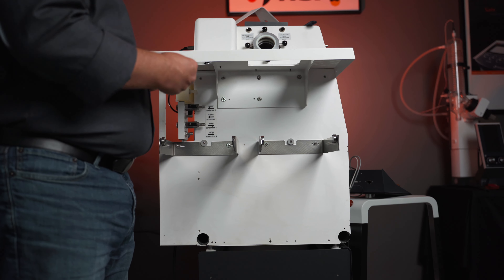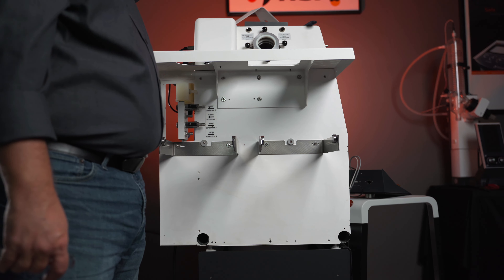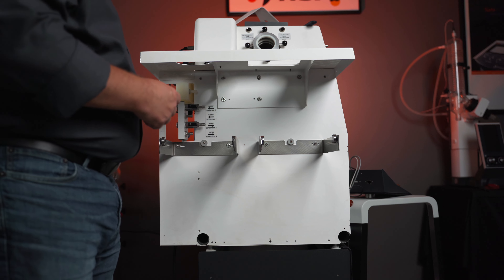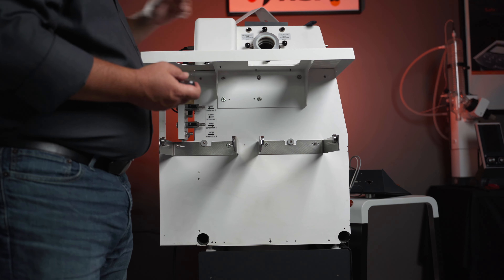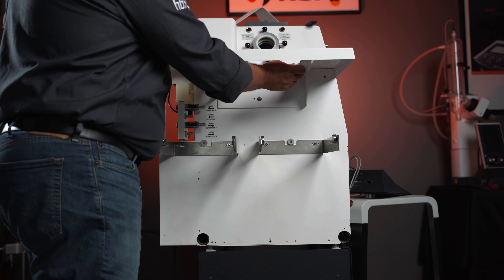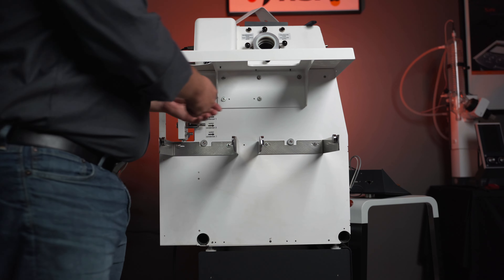After you have your front panels removed, the next thing you're going to want to do is remove everything on the side of the unit: your glassware, your glassware cabinet, your panels that are on the side, your receiving cassettes. Once you have all that removed, the first thing we're going to do is take off the mantle. There are five screws that hold the mantle in place — three on the top and two on the bottom — and they are T25. So with that, we'll start removing the mantle.